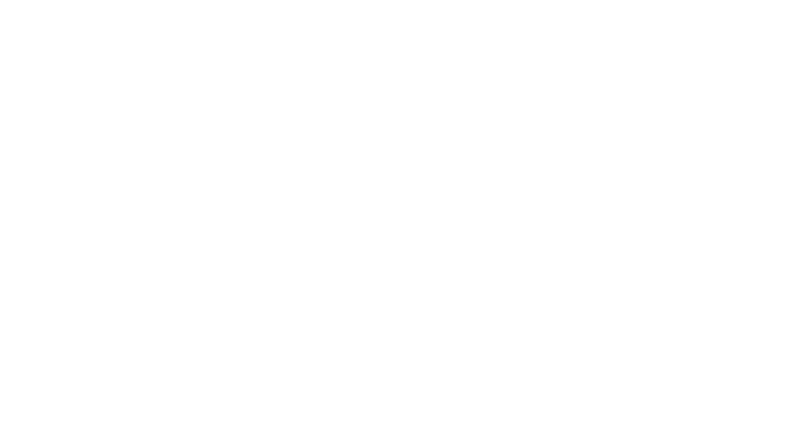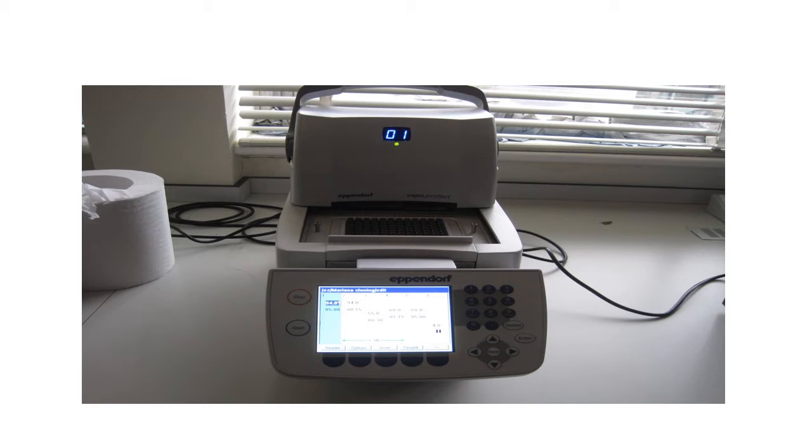In the first photo we were shown a standard PCR machine, opened to show the reaction wells where you place your reaction mixture. The display at the front allows you to set the temperature and time of each phase and the number of cycles.